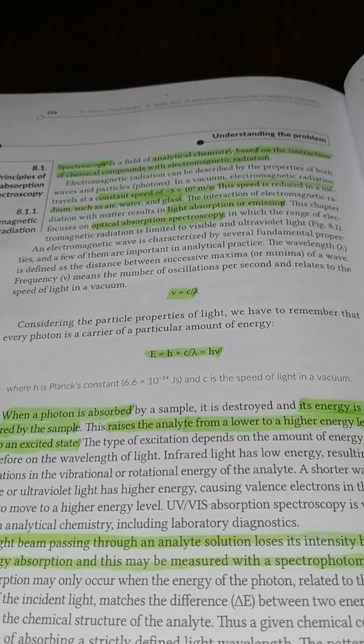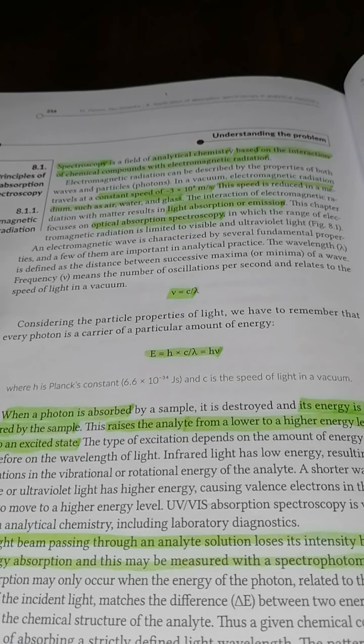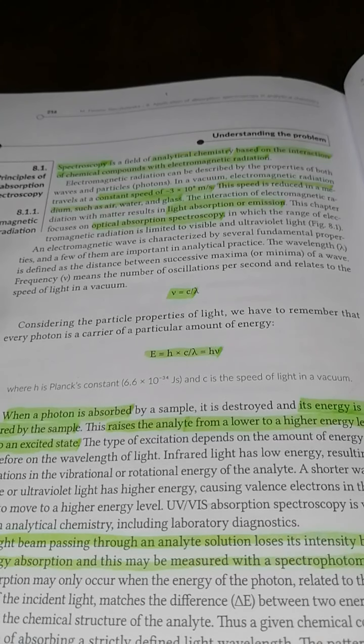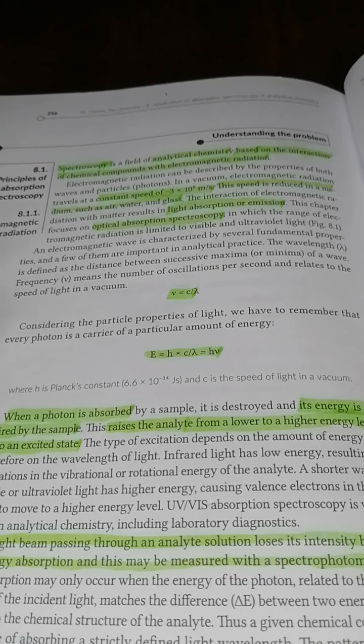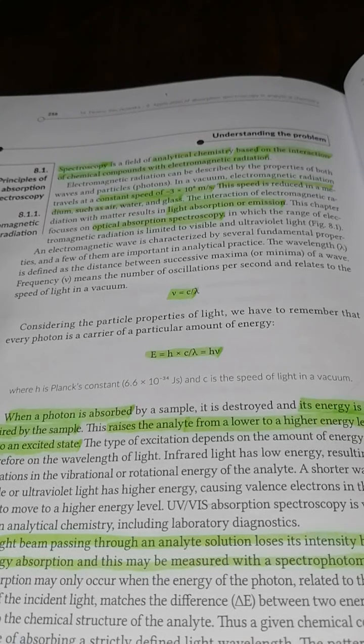So what is absorption spectroscopy? What does it depend on? As you figured out, the last 3 units are about analytical chemistry. So you're trying to figure out what components of a certain mixture you have. If you're trying to identify some proteins or some lipids or any molecules, you can do that either through electrophoresis, chromatography, or in this case absorption spectroscopy.